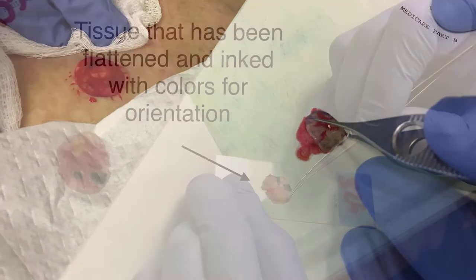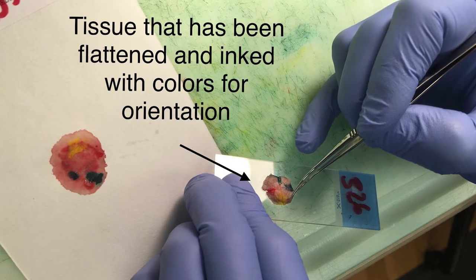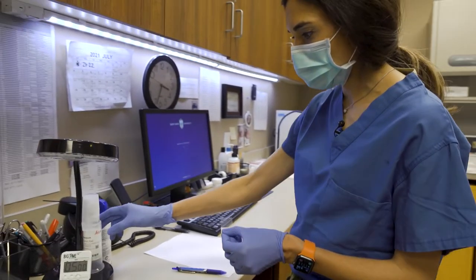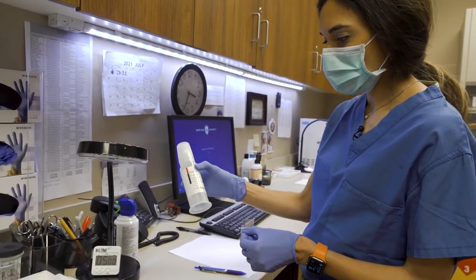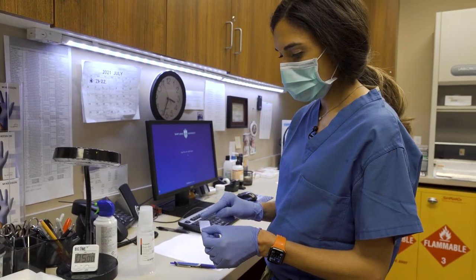The first step when the specimen comes in is to get a glass slide. The specimen is placed on the slide and it is attached to the slide. Following this, we come over here and there is a product called cryogel which is then placed over the specimen.